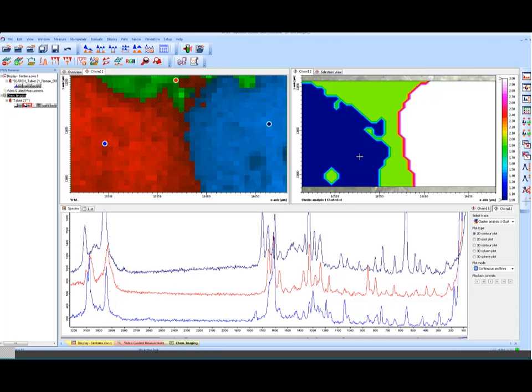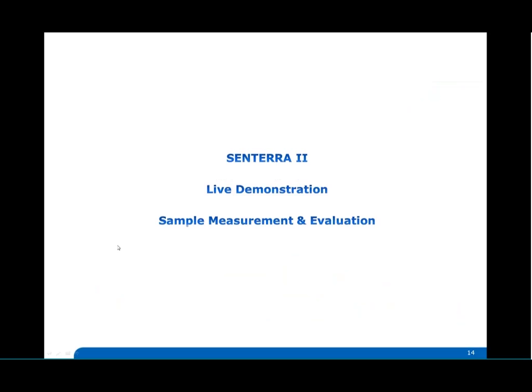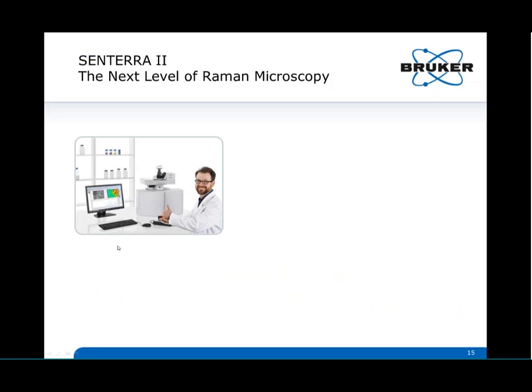So with this, we will close now the live demonstration. I will summarize our demonstration with the last slide. So let's go to the last slide.